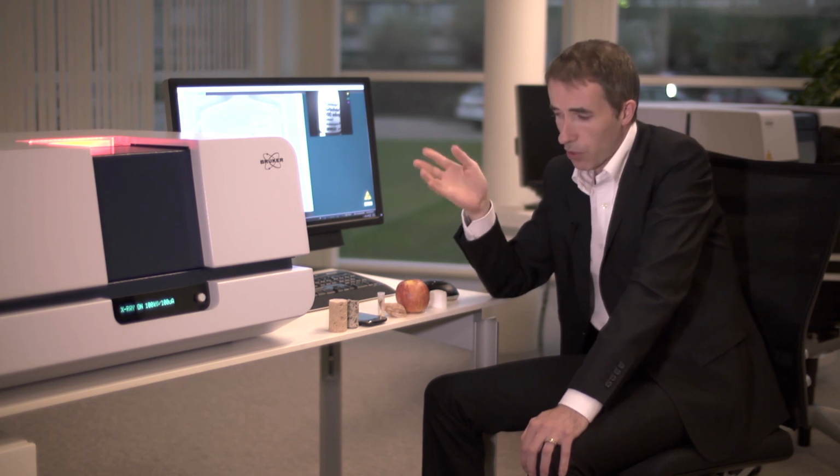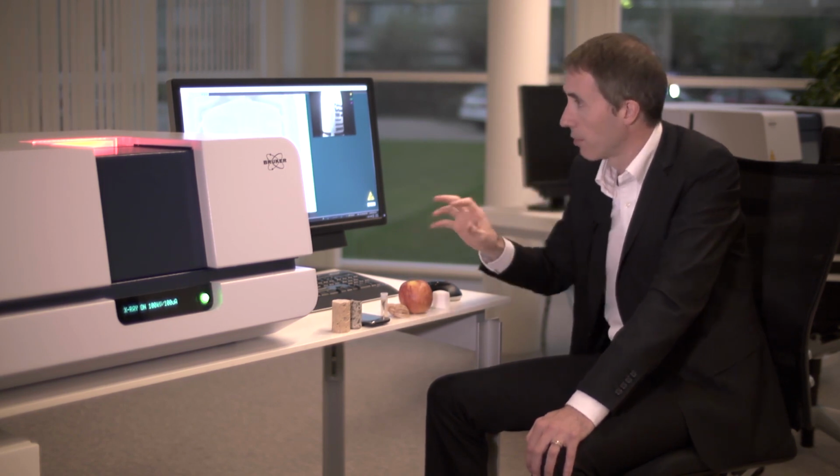The total scan time, as you can see, is very short. It's typically no more than a couple of minutes. Depends a bit, of course, on the density and of the voltage that you have. The voltages of the system go up to 100 kilovolts, which is more than sufficient to scan all these objects that you can see here in front of you.